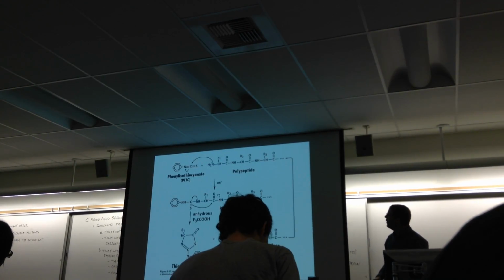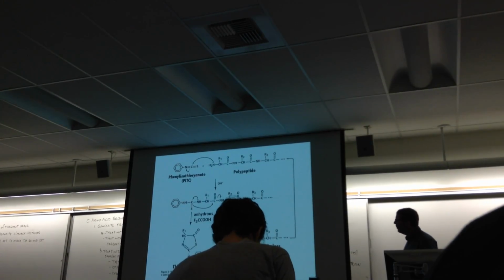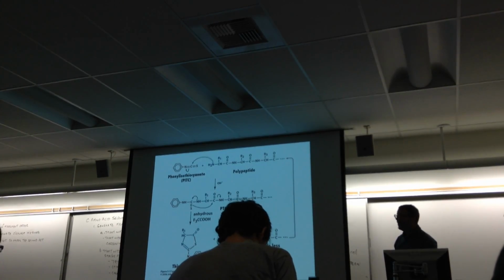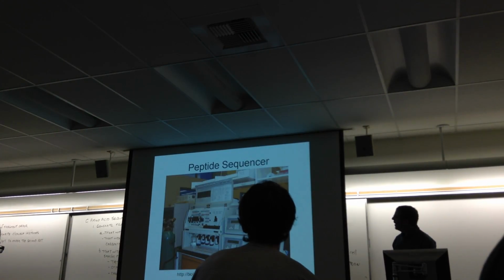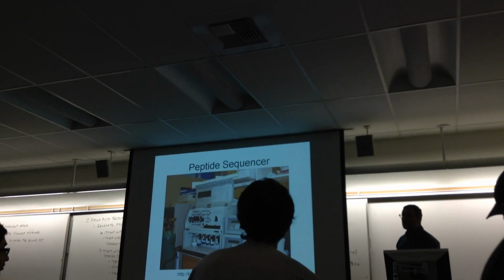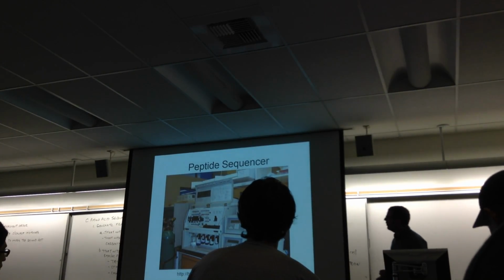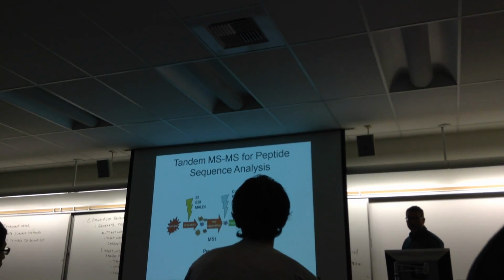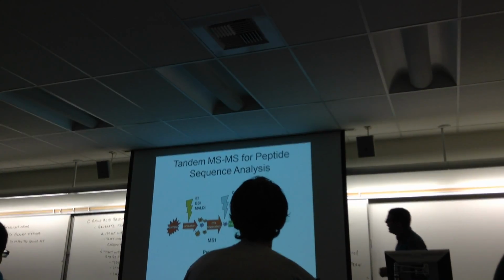This is the Edman degradation. This is reacting with phenyl isothiocyanate, and you go through all of this chemistry. The Edman degradation also was pretty automated. Basically, here's an example of a peptide sequence. Okay, but then this is the tandem MS, MS/MS, peptide sequence analysis.